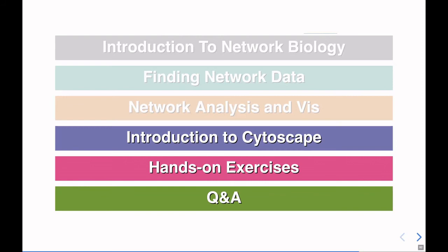I have a network and some nodes and connections, but how can I choose one of them for further analysis, or what shall I do with this network? Like clinicians, they ask, okay, you have a wonderful network, so what else?